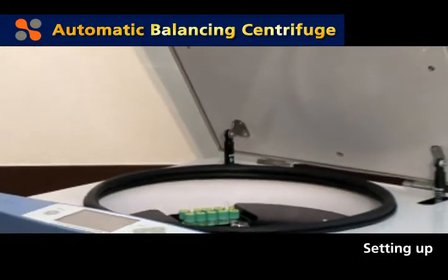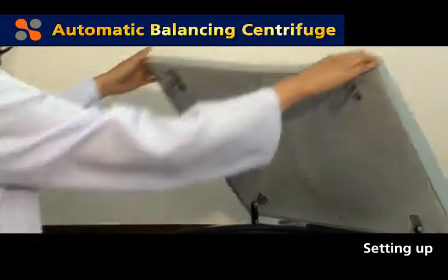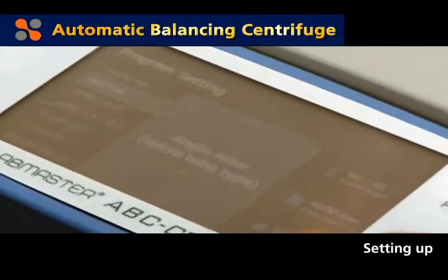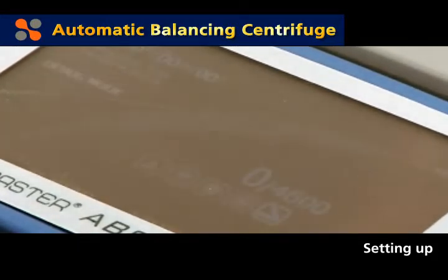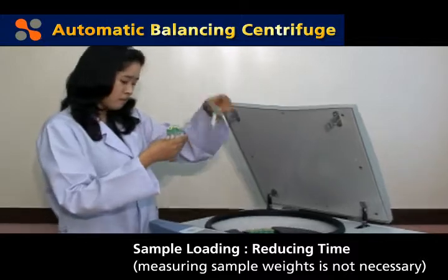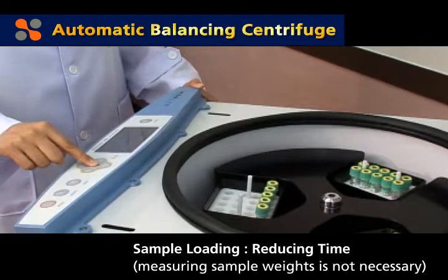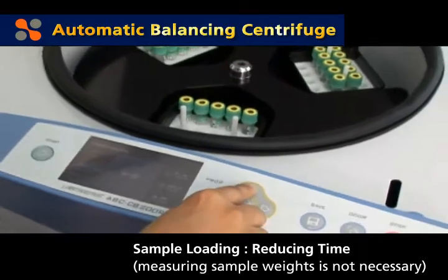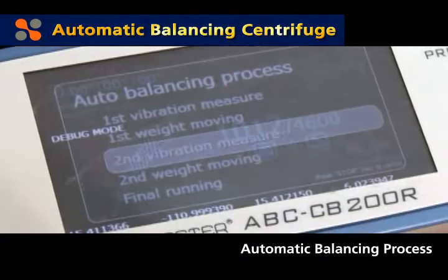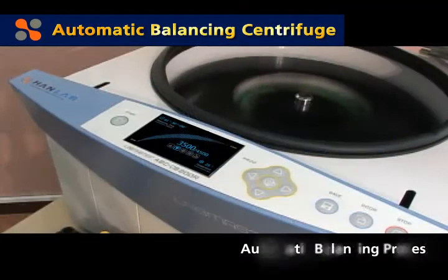Setting up is the first stage of the centrifugation process. LabMaster ABC is the first to implement automatic balancing, which secures stable centrifugation of loaded samples through an intelligent vibration sensor and self-balancing mechanism. This is a cutting-edge technology that saves time and effort in measuring precise weights using a scale to adjust weight and symmetry — steps required when using conventional centrifuges. When closing the door and pressing the start button, you can see the process through the LCD display.